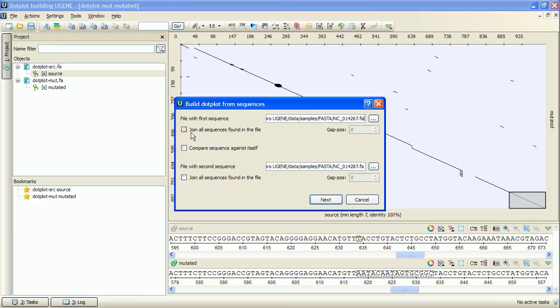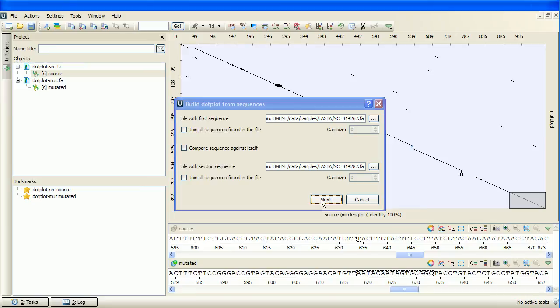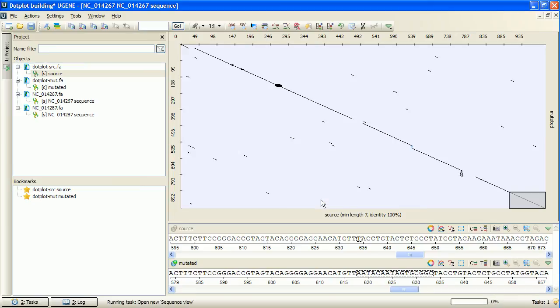To do this, check the join all sequences checkbox. I press Next and specify the parameters of the new dotplot. I will use the heuristic 1K results button and press OK.